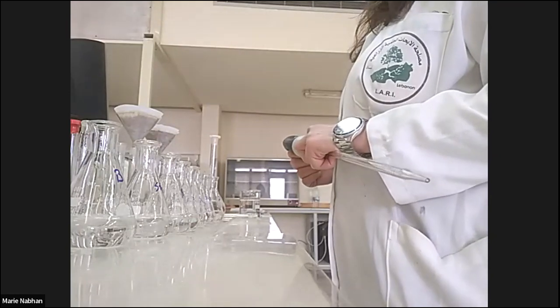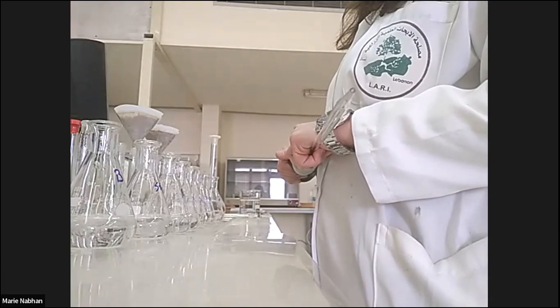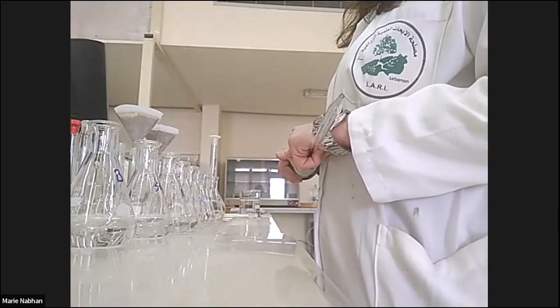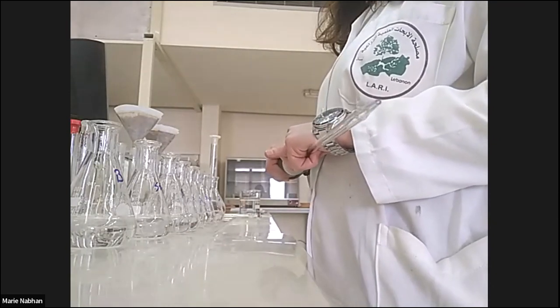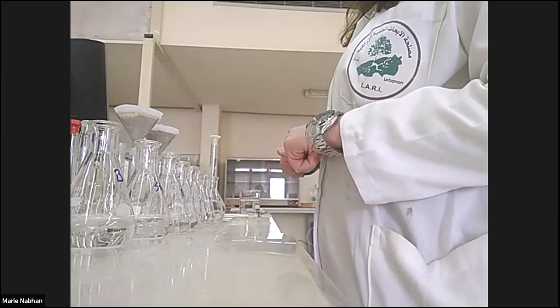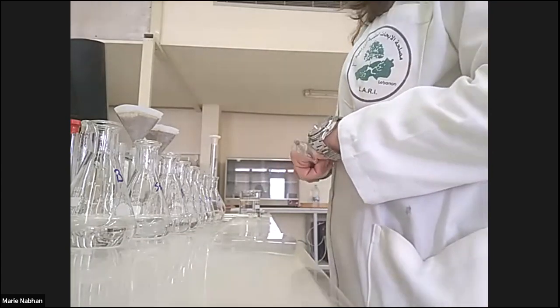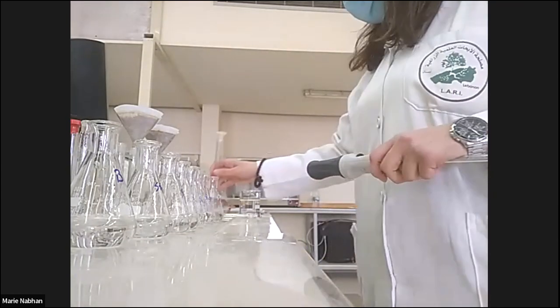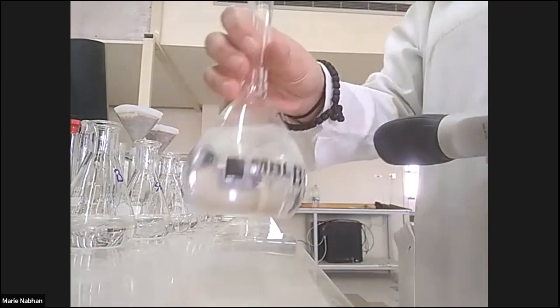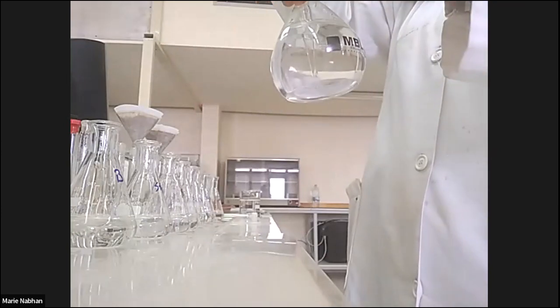From the suspension, since we expect that we might have a lot of sulfate, I did the dilution 1 to 5, meaning 10 milliliter of the suspension in 50 milliliter of water. I will start now by adding the HCl, 10 milliliter, to every flask.